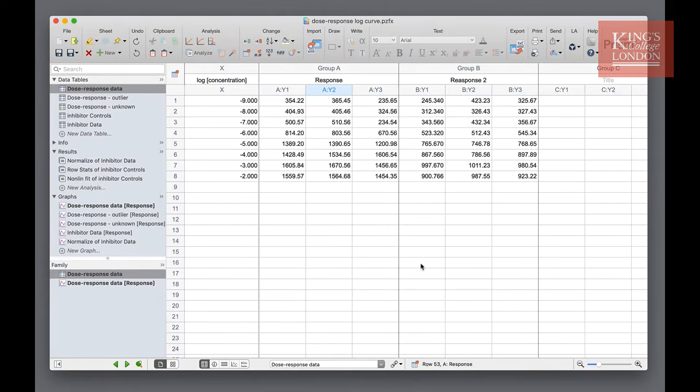The use of these models will of course depend upon your experimental design and might include enzyme kinetics, inhibition or enzyme activation studies, or simple biochemical interactions. For the sake of this demonstration, we are going to use synthetic data showing both response and inhibition.